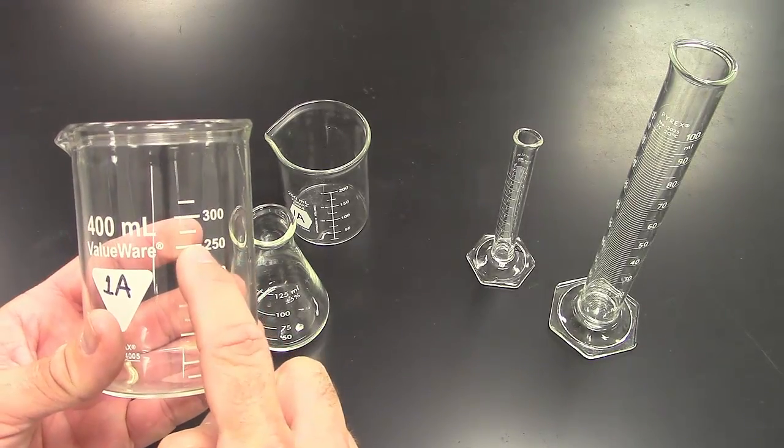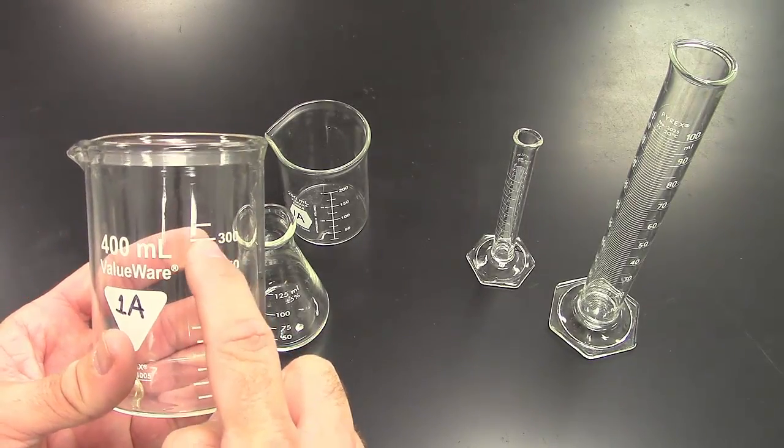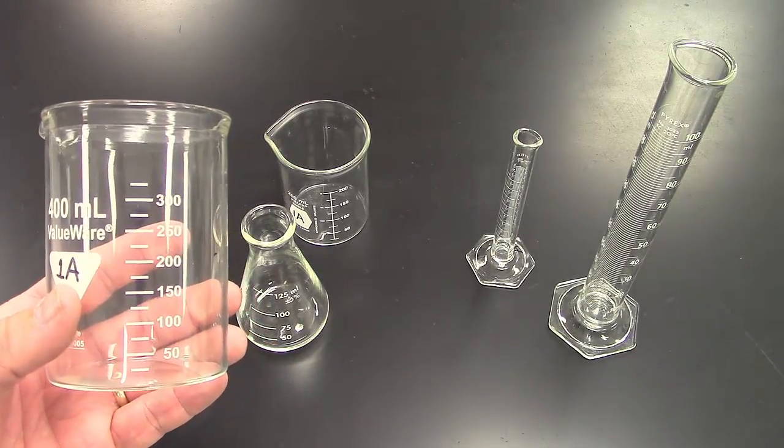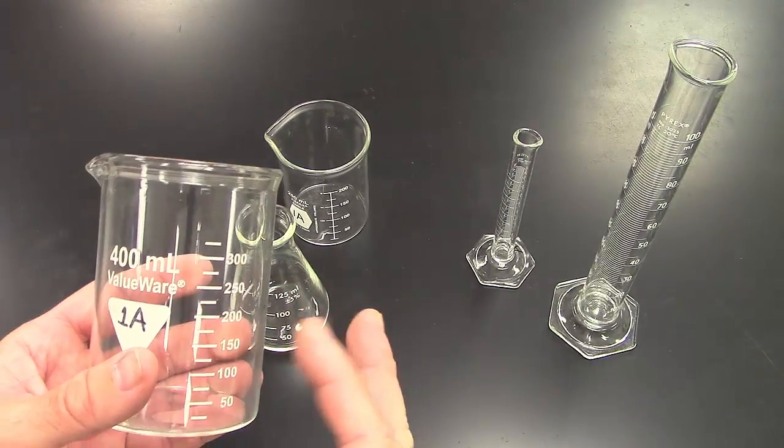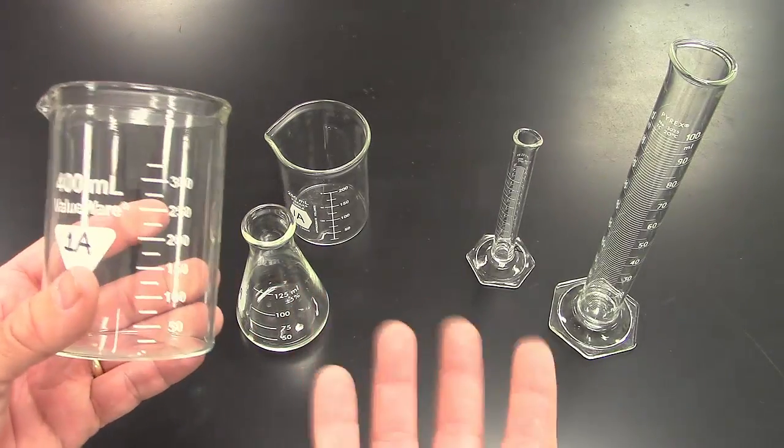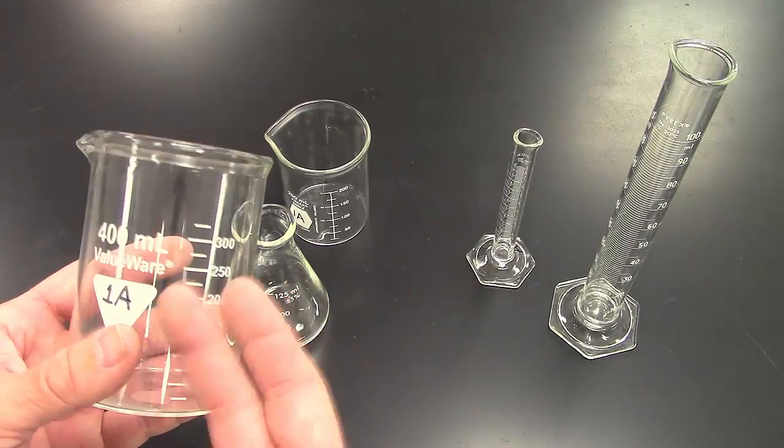For instance, 250, that one would be 275. So each one of those lines is 25 milliliters. So if you were to estimate or go to a tenth of what's there, it's not really even like out of 10. So it's really hard to do. You're not sure where exactly we would record it.